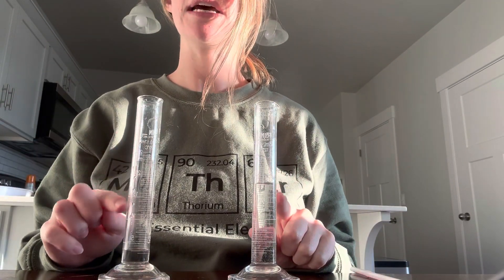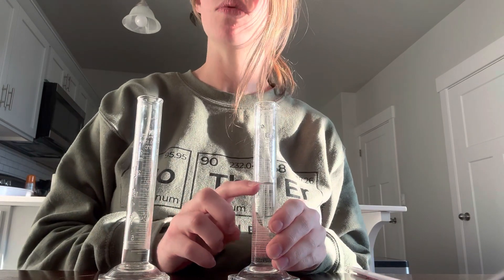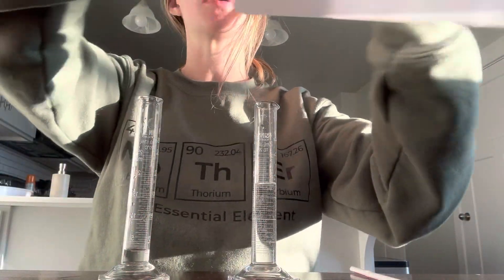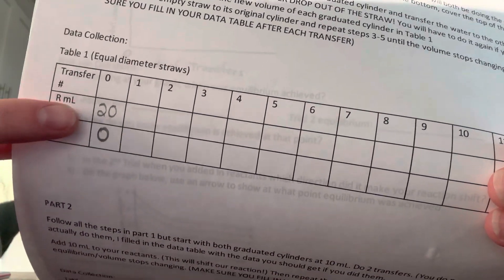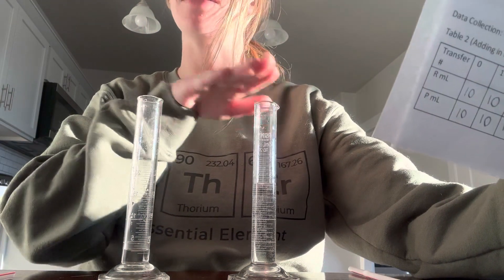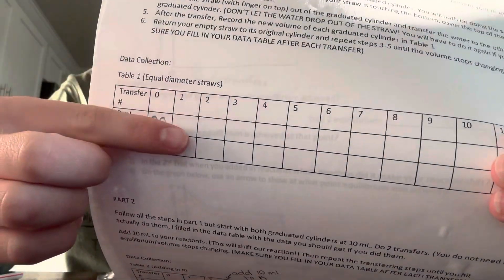That's transfer number one. After you do that, you're going to look to see how much water is in each of them. You need to go down low and be eye level with it to record the right number, and you're going to record that on your data table right where it says transfer one. Your reactant is what started off with 20, so this one is going to be my R every time, and this one's going to be my P — my products every time. That's how you know which box to fill in.